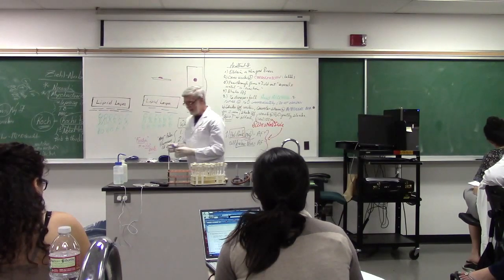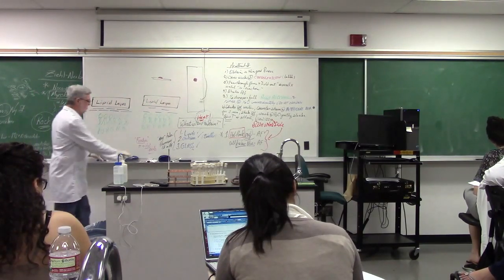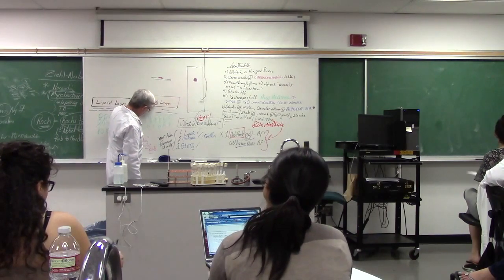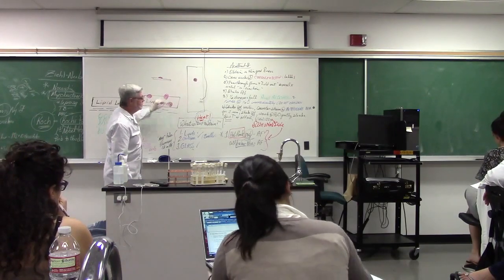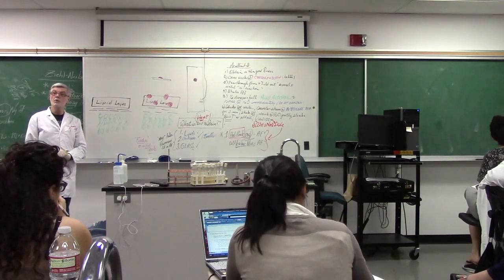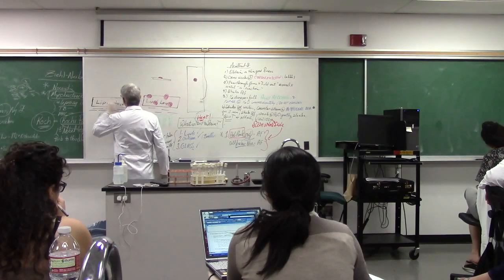So, that takes us to problem staining. Let's talk about problem staining. Remember, the carbol fuchsin gets trapped in this lipid layer here, and that's why that stains hot pink. But carbol fuchsin is again dissolved in both water and an alcohol, so some will reject it. So some of them will just stain the last color you put on, which is baby blue.